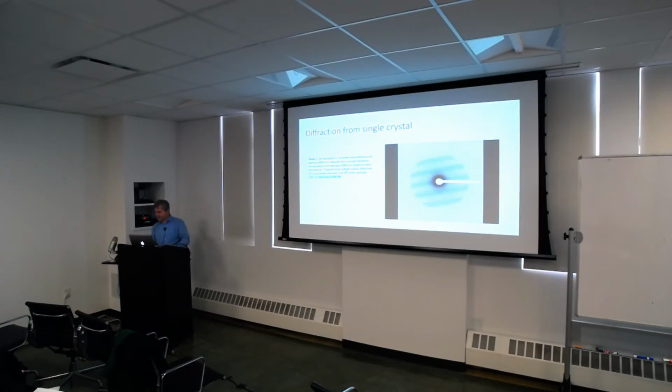It doesn't look like a typical diffraction pattern. It might be very weak, and it might also be masked by the circle. Yeah, I think so. You only see the very intense reflections. Well, this was the first one. It's almost like take our word for it, they're there. They solved it.